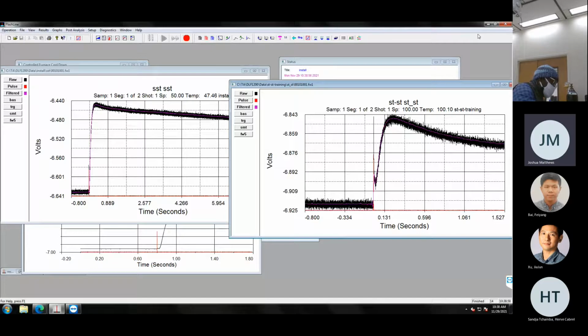Another question we have: if you want to use a liquid sample, how is the sample prepared? Because in this case, we cannot use graphite. For liquid samples, there needs to be a specific holder for that. It doesn't look like you have that.